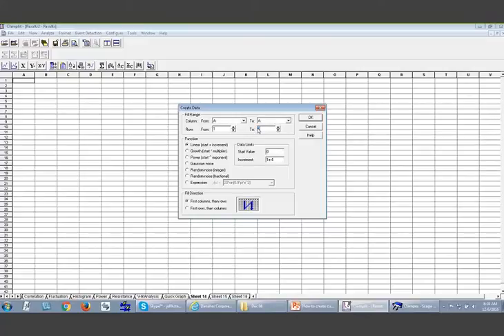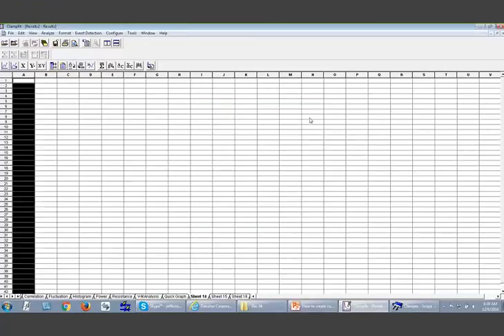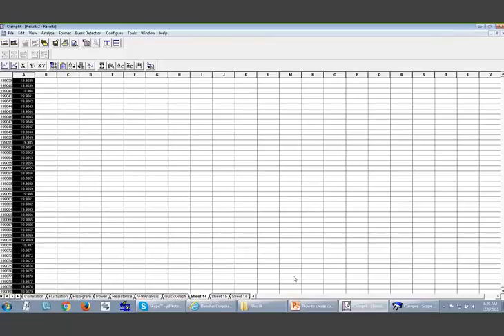In here, for 20 seconds, you need to type 20. Actually, I would like to say 200,000, in order for you to have more sampling points. So you need to type 200,000. Now let's go to the linear. The increment is 0.0001. When you do that, you view all the way to the bottom, and that will be about 20 seconds.